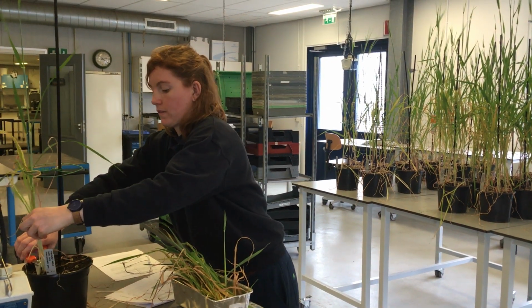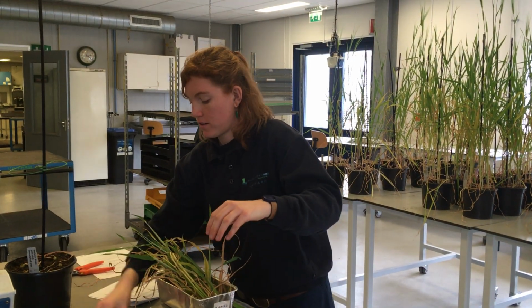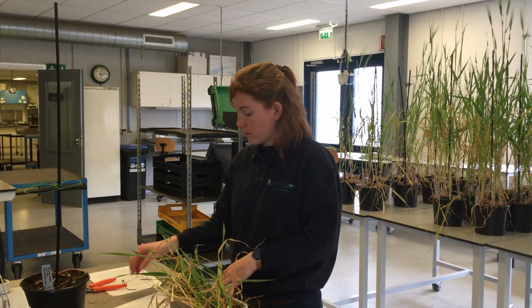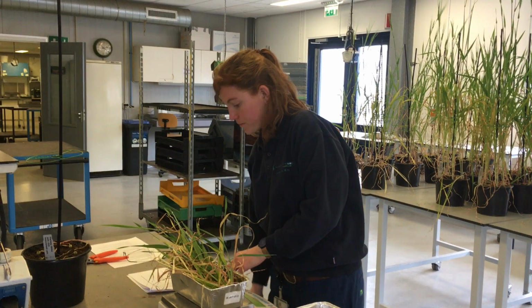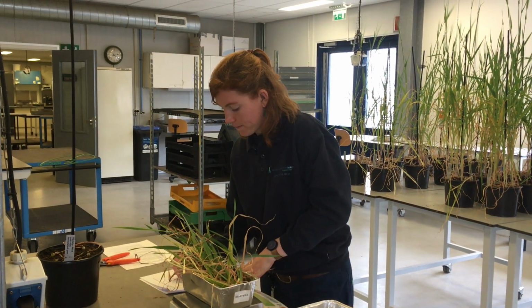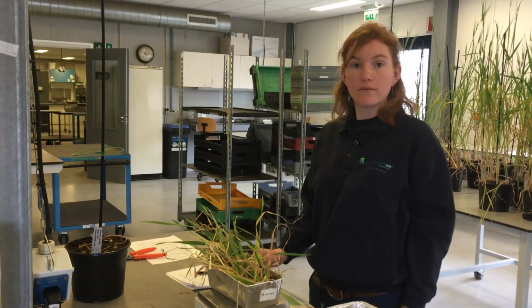Now the last plant. So yeah, we did have five plants in this one. And here we have 59.9 grams, almost 60 grams worth. That we can put on the table. Then in such a way, we will measure all the non-infected and infected plants. This is only one, we are not going to do them all, but this is the way how we measure the fresh weight.